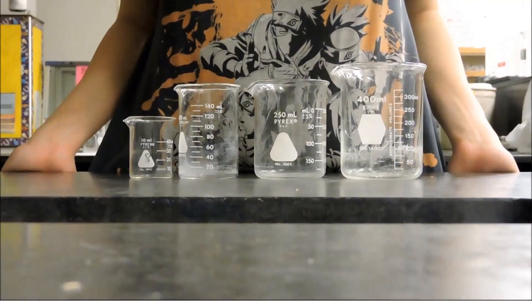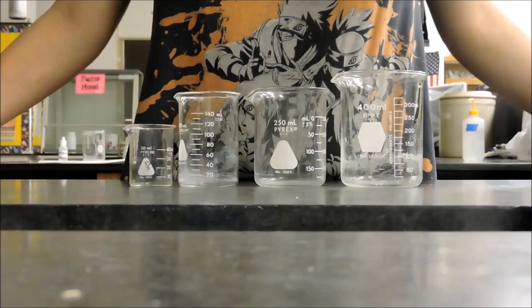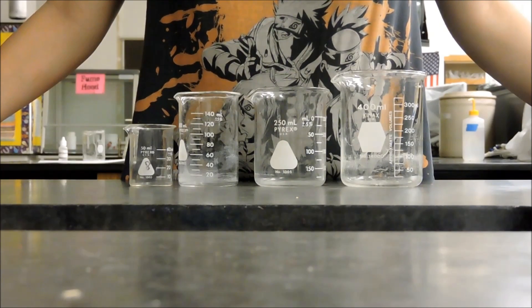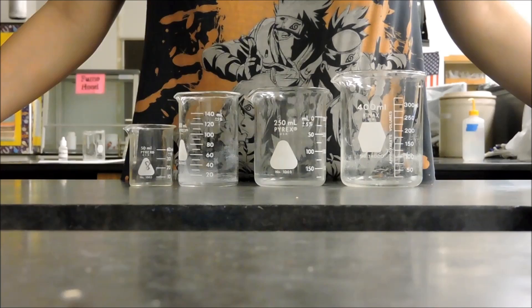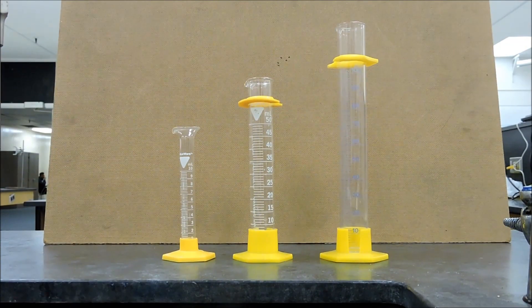There you go, these are beakers. They are used in multiple labs. You will use them to measure the volume of a liquid. They are the least accurate sources of measurements. Graduated cylinders are also used to measure the volume of a liquid. These are more accurate than a beaker and a flask.